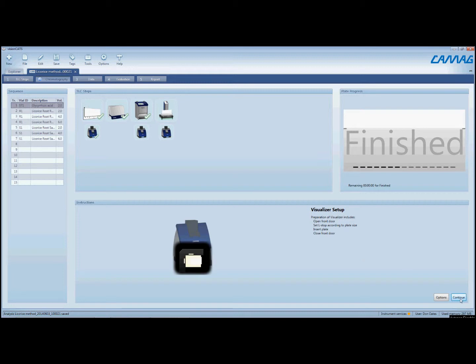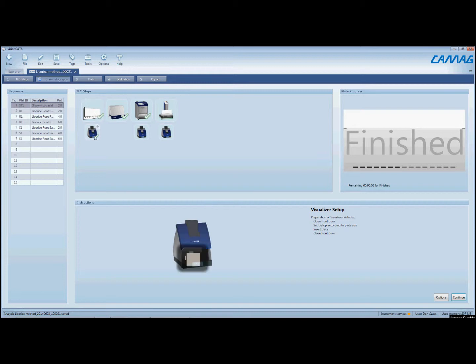And now we're going to click continue in order to acquire the images after the development step. You'll notice up here, as each step is complete, you'll have a check mark on each icon.